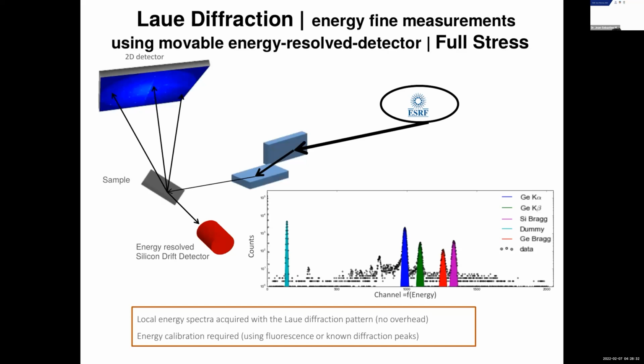One solution would be to move the detector a bit to larger angles. Could be a way, but maybe the disorder will be too high, so I don't know if we could find a compromise, a geometry that really suits protein measurements, because we can't reduce the spectral band easily.